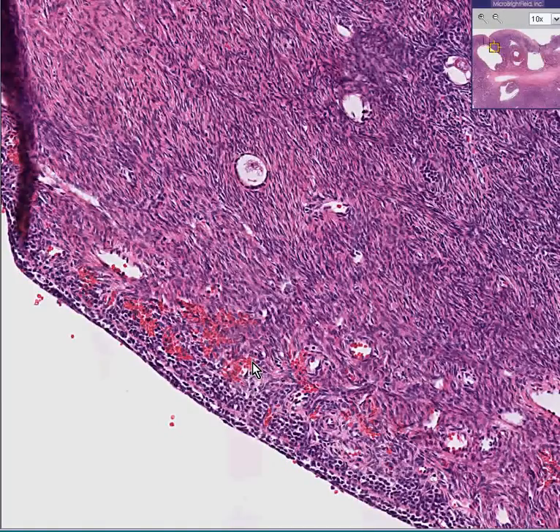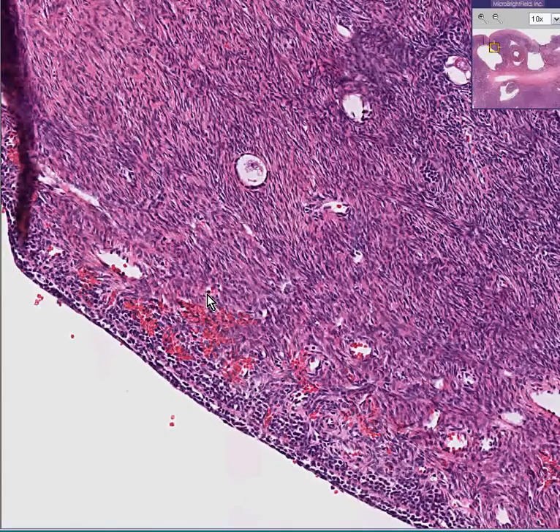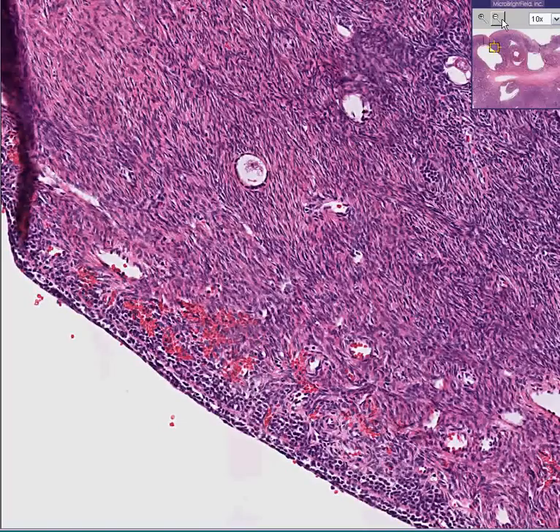The cysts, of course, do not turn into cancer. They are the single most common cause of infertility worldwide. Thank you very much.